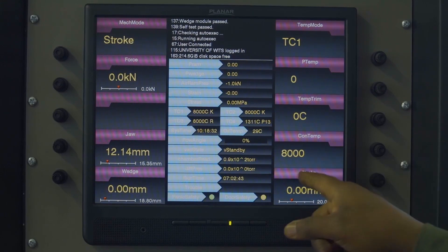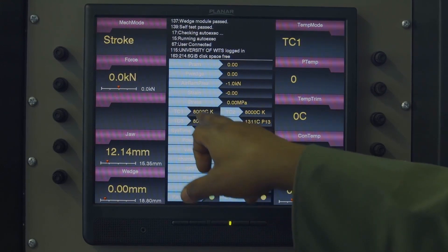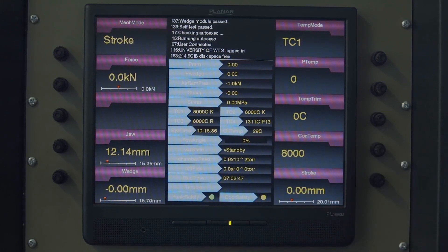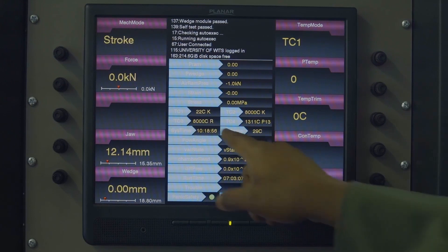I'm just going to connect the thermocouple on the terminal and then show you how this changes from 8000 to whatever the temperature is. I think it will be close to room temperature because we have not started the experiment yet. I'm going to connect the thermocouple now and keep an eye on the TC1 and see what happens. You would see that it has changed to 22 Celsius indicating that the thermocouple has been connected.